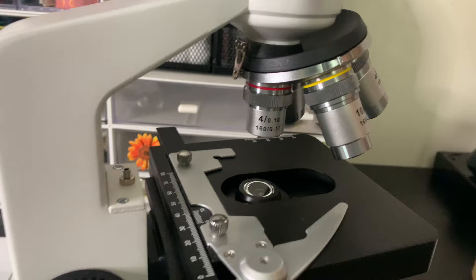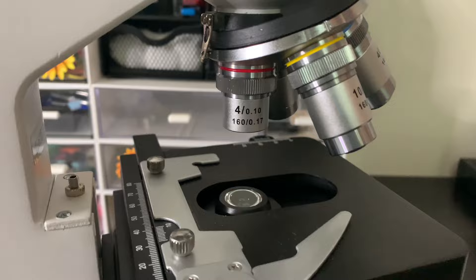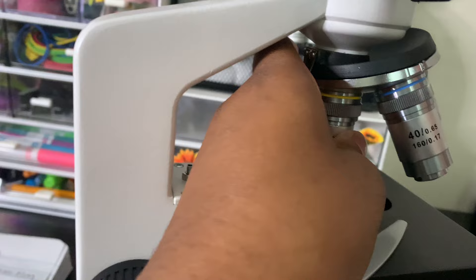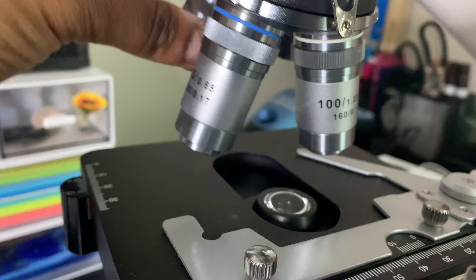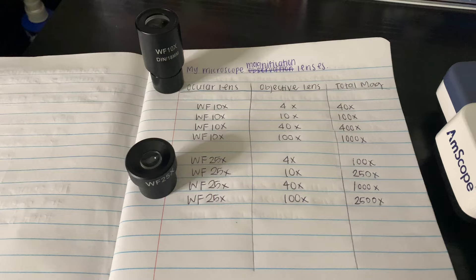Now we're going to go into the objective lenses. Right now this is the 4x objective, and then you can spin it around — you hear it click — and then this is the 10x objective, then the 40x, and then 100x, which is the oil magnification.